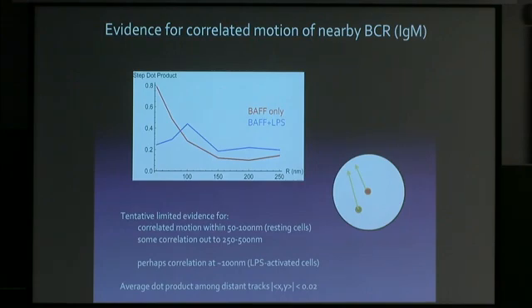So individually they can look Brownian, but together they could be moving kind of in sync. What I'm plotting here is the average dot product between the steps for different expansion radiuses. If the dot product on average is 1, that means they're moving in lockstep and never deviate from parallel. If the dot product is 0, then they're probably on average either moving at 90 degrees or on average moving independently.